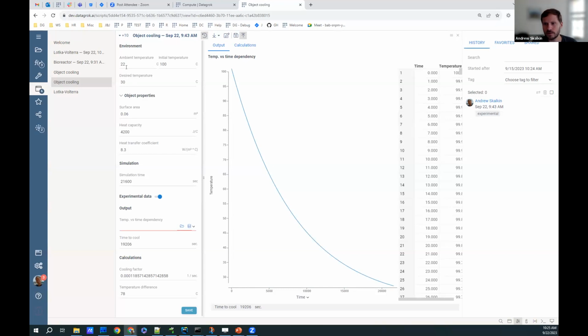It's completely reproducible. From what I thought, the inputs and outputs just become values in a data frame, and that's what you visualize. No, not necessarily. You can have multiple input values, which can be of any type and any number. But also the output parameters, you can have multiple output parameters. You can have multiple data frames or, very often, a combination of data frames and scalars. And you will see it in Victor's presentation later. And yeah, all of that is saved when you really want to save the run. Okay, thank you.